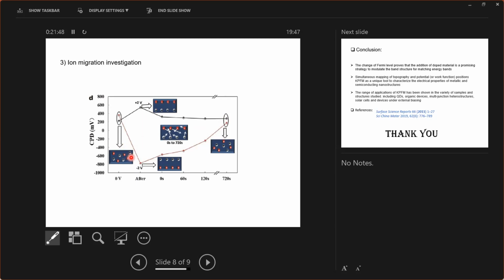Yes, but you cannot get everything in the reference. If you modify something, you cannot get that reference. Here you cannot get the difference, but here it is about the time. No, they have fixed one voltage now. Which voltage does one need to fix initially? That is the CPD that you are going to get; based on that you have to fix the voltage.